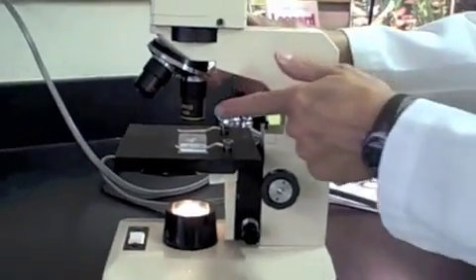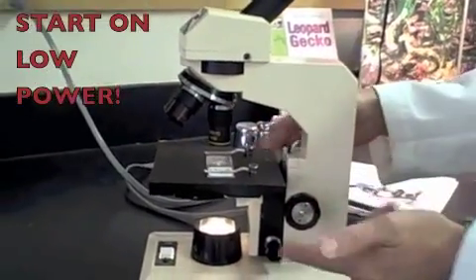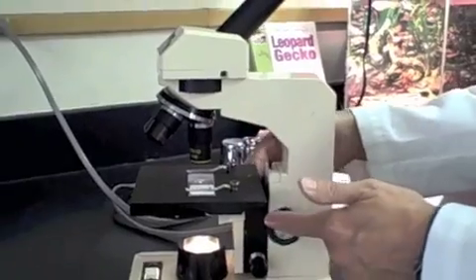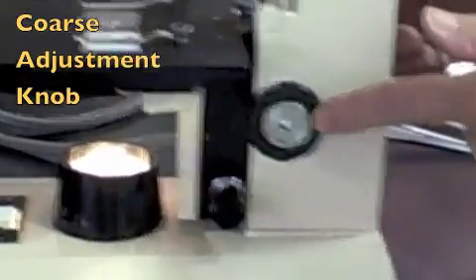We always start on one of the low power objective lenses and we use this big knob. What's that big knob called? It's called the coarse adjustment knob.